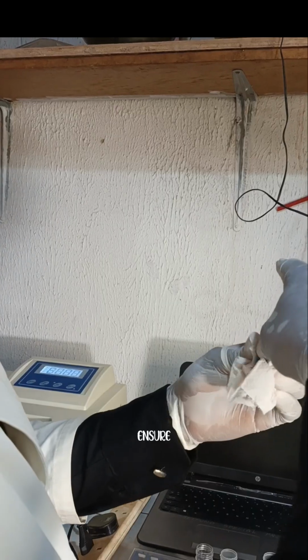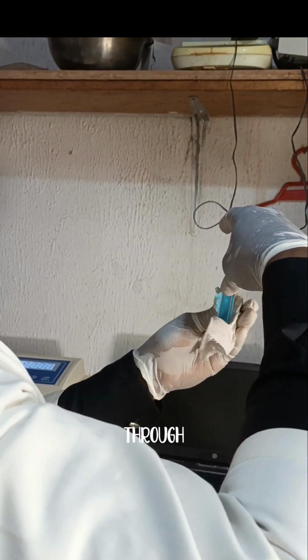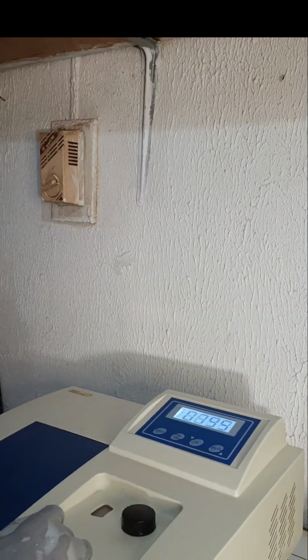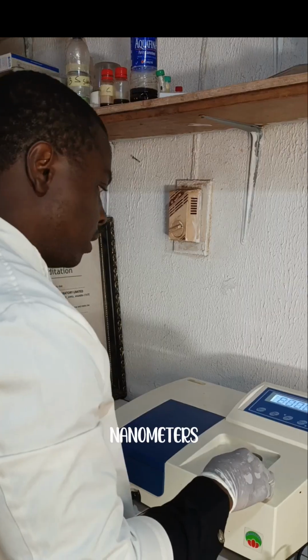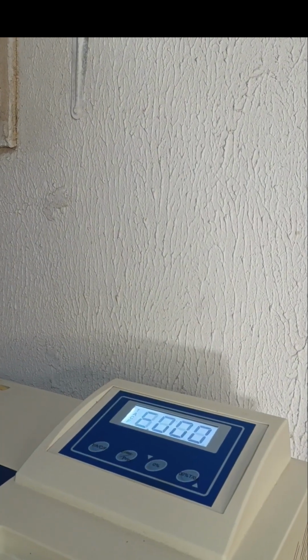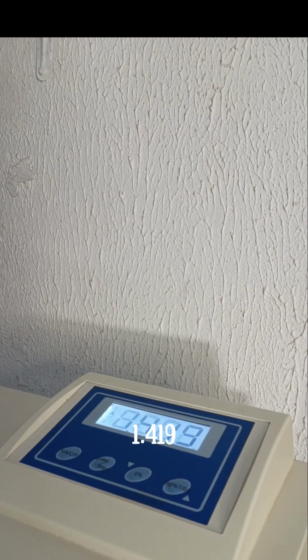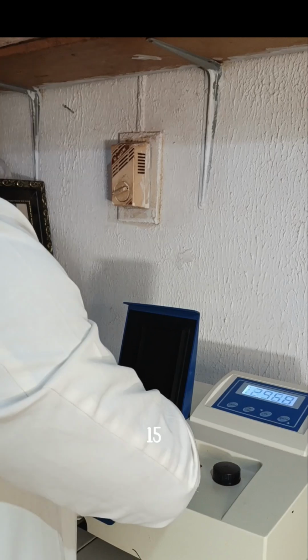Once we add it, we ensure that we clear the glass part, the part that the light will pass through. Remember that the wavelength that we are working is 680 nanometers. So you can see the machine is at 0. Then we take the reading of the absorbance. And the absorbance is 1.419. Then the next will be to run the 15.